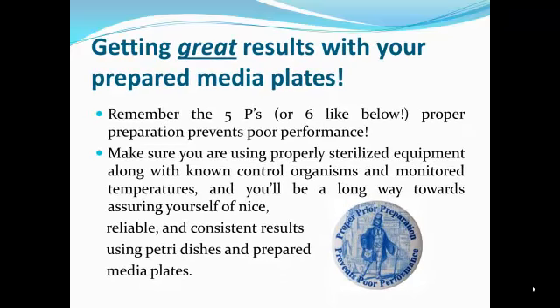Getting great results with your prepared media plates. Remember the 5 P's, or 6 like below. Proper preparation prevents poor performance. Make sure you're using properly sterilized equipment along with known control organisms and monitored temperatures, and you'll be a long way toward assuring yourself of nice, reliable, and consistent results using petri dishes and prepared media plates.